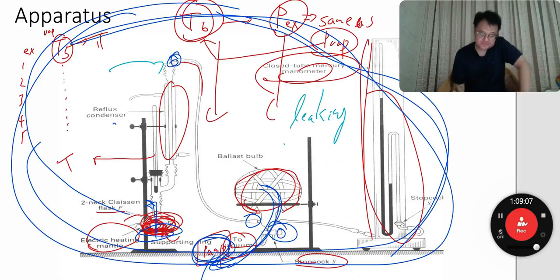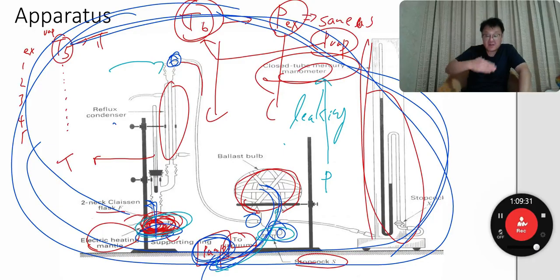So as a function of time, if you close the system after evacuating below something like 80 millitorr, the pressure will gradually increase as a function of time, okay? And your liquid will boil, and the temperature will increase as well, right? So this liquid is further boiling and boiling.